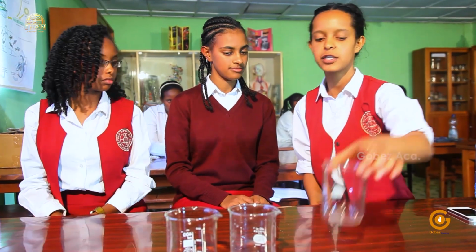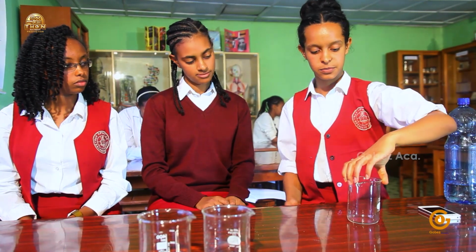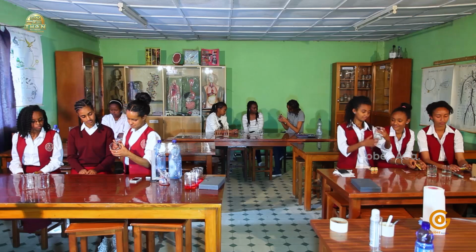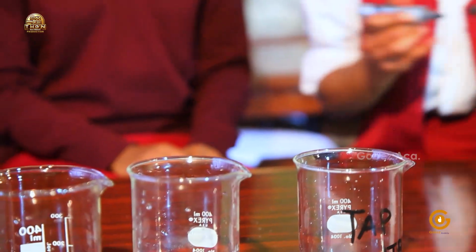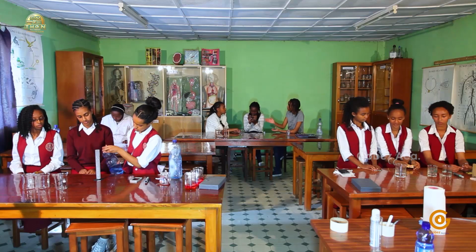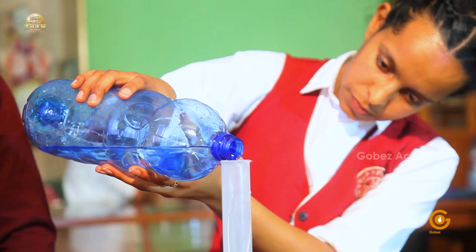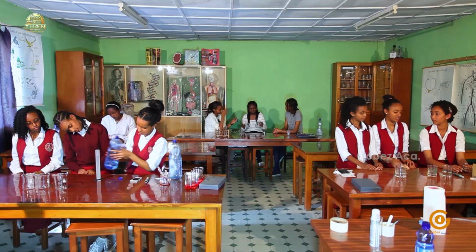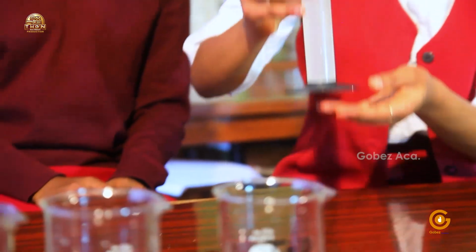So on the first beaker, just like I did in the two experiments, I write tap water on it. And I pour water from the tap into the beaker.